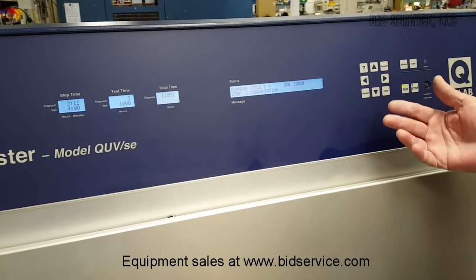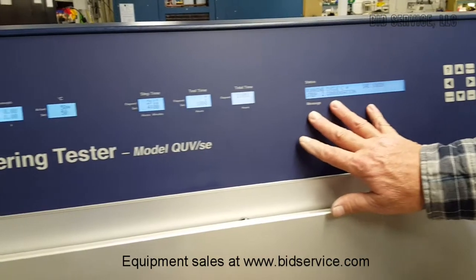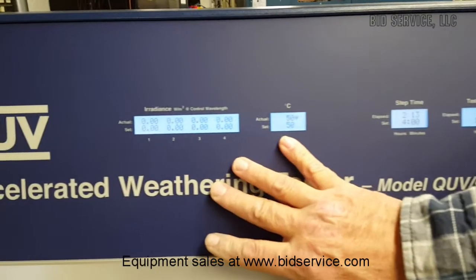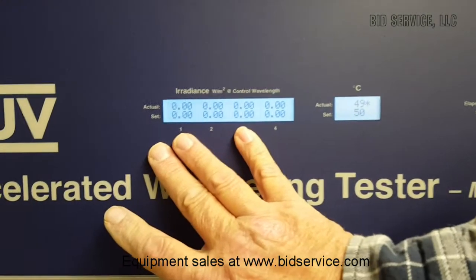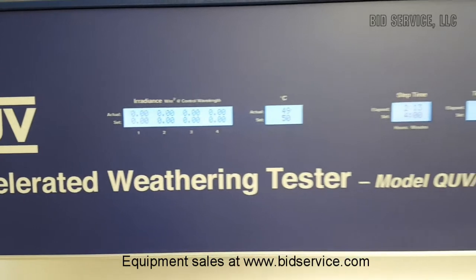You may have stopped a run and you can continue. You can see here we have our status, our total time, test time, step time, our current temperature — actual versus set — and our UV irradiance. Now I'm in condensation mode, so there is no UV irradiance currently. I'll show that in the next step.